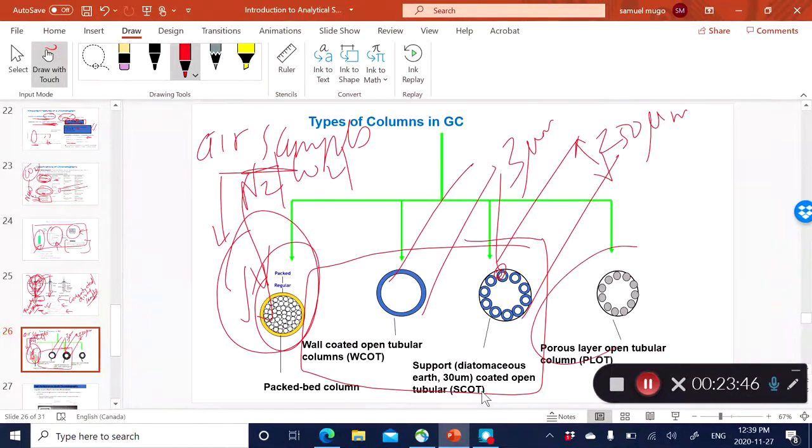But also there's another type of open tubular column called the porous layer open tubular column. And often this is where you make a polymer around the tube, but the polymer itself is almost like a sieve, meaning it's a porous film. So this one is a very porous film. And I do this a lot in our research group here in McEwan. We develop different types of porous layer open tubular columns using different types of polymerization chemistry.